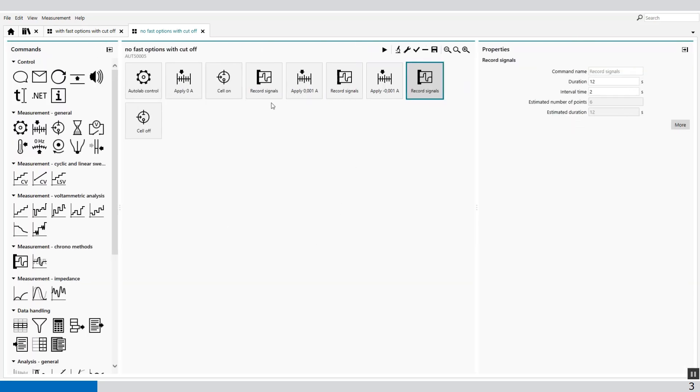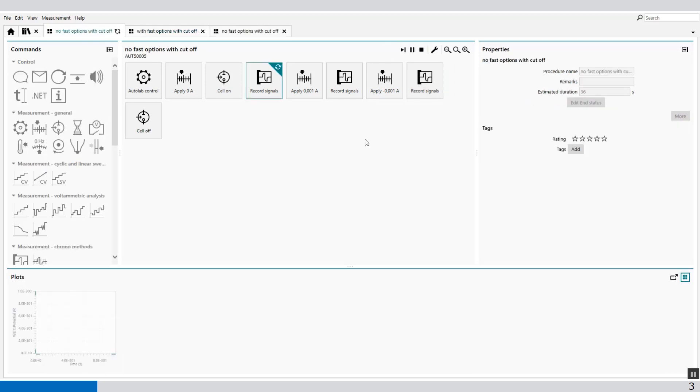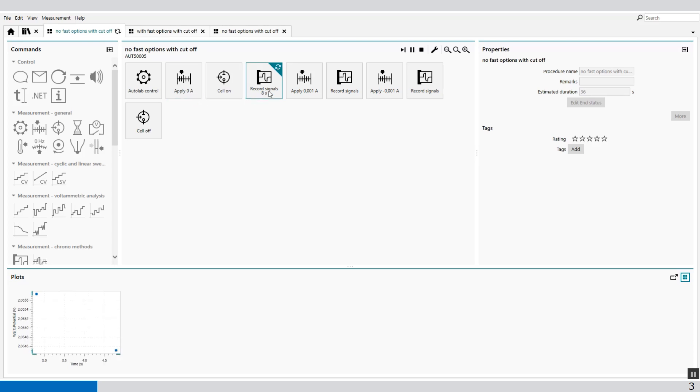This is the procedure without the fast options selected. When I press start, first I'm going to apply 0 amp for 12 seconds and an interval time of 2 seconds, which means we have 6 data points.